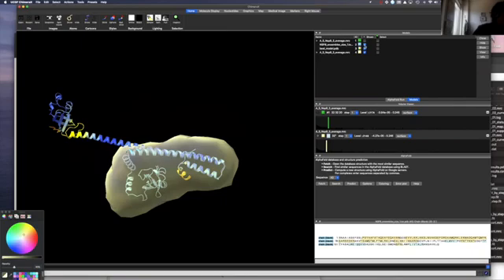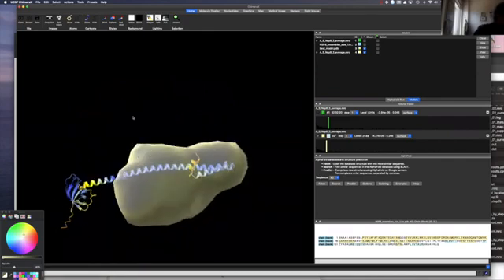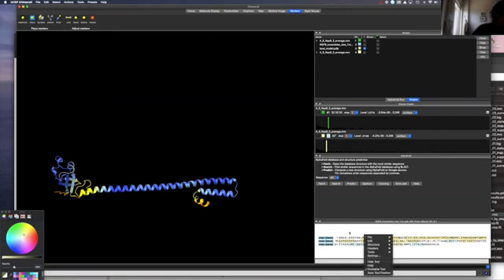This is what you see here in the ribbon. That's from while Greg was talking, I was calculating this AlphaFold model, sorry. And the AlphaFold model is also shown in colors, where the low probability fold is in yellow and the blue, and they make it so easy that this Google interface, the Google Colab, is directly plugged into Chimera. So if you go here, okay, I'm here. Yes, when you have a sequence uploaded, I already have it open.